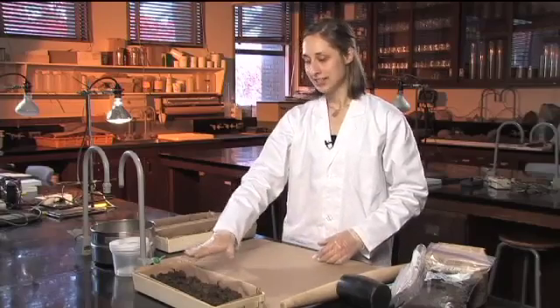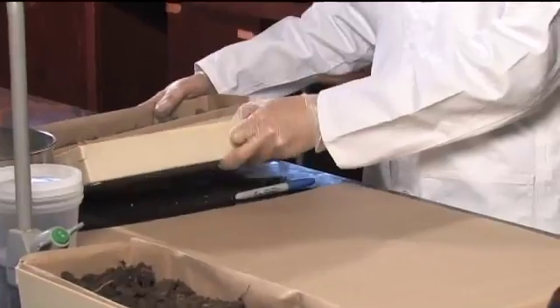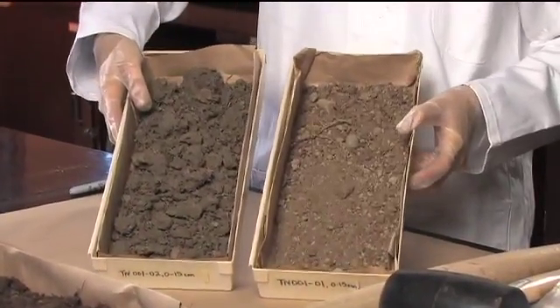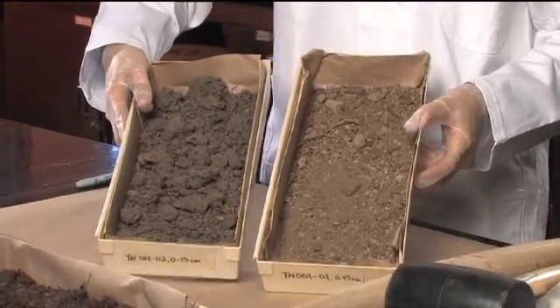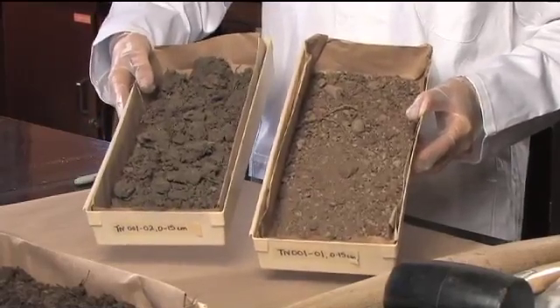After you're satisfied that it is fully air dry — here are some samples that are already dry — you want to crush and sieve it. There are several options: you can use something mechanical like a Wiley mill to crush the sample, or you can also hand sieve. We're going to do hand sieving today.